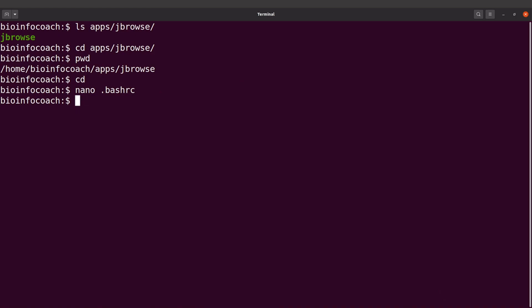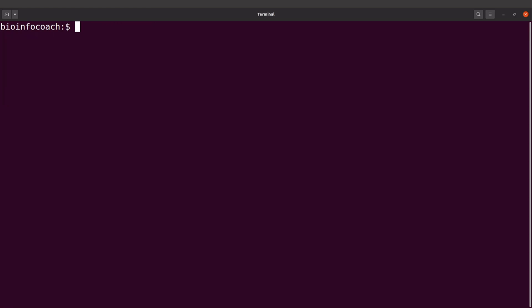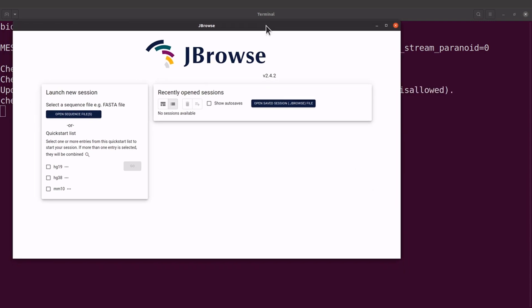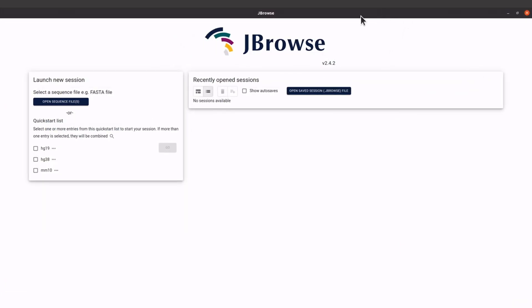Now that's done. Let's open a new terminal and test it. On the new terminal I'll just type jbrowse, and once I do that JBrowse opens for me. With what we've done, no matter where you are on the system you can just call JBrowse by its name and it will open.